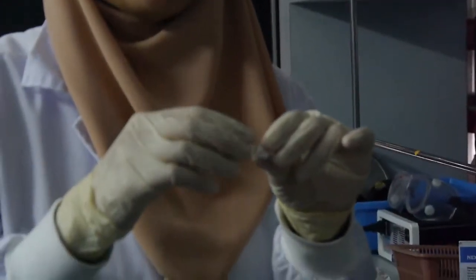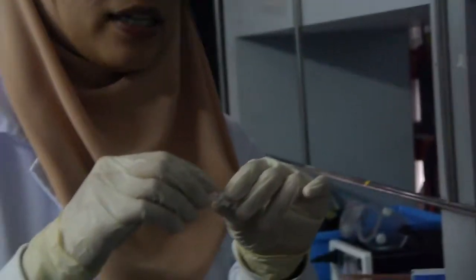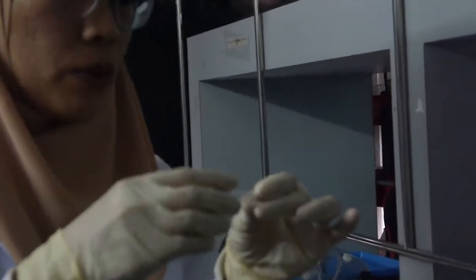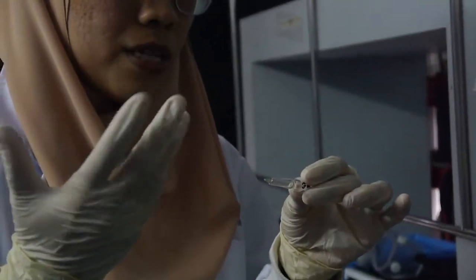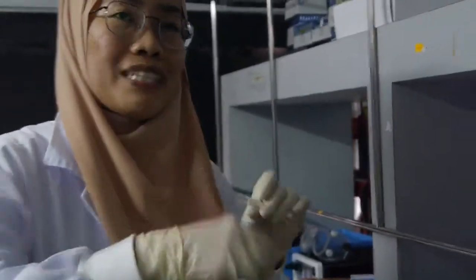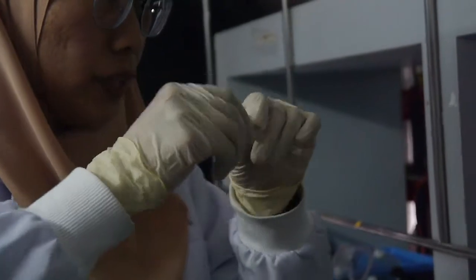Prepare the sterile tissue first. Okay, you cut the tissue to the size of this ampule. So you sterilize the tissue first. Then when breaking this ampule, you need to seal the ampule with the tissue.